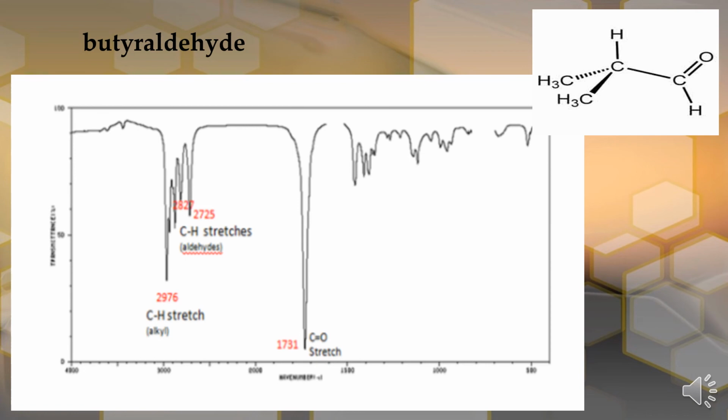And per our previous group frequency example, the aldehyde is going to be between 1740 and 1725. So that puts us right in the middle of our example at 1731. So that's how you'll know where your carbonyl reads on the IR spectrum.